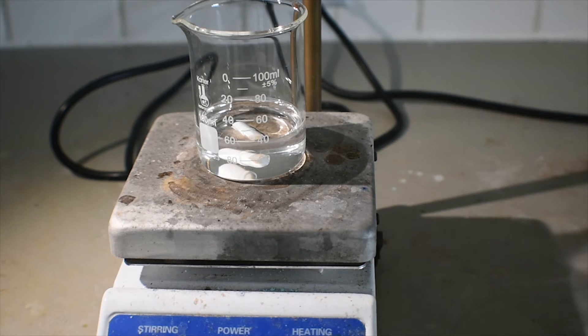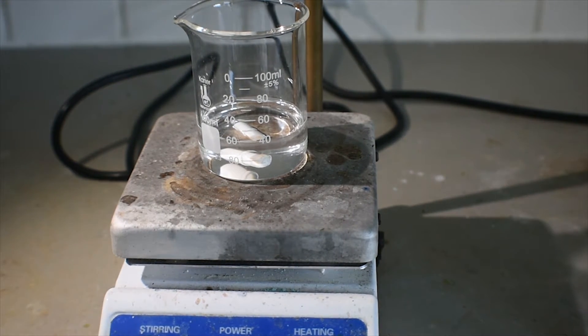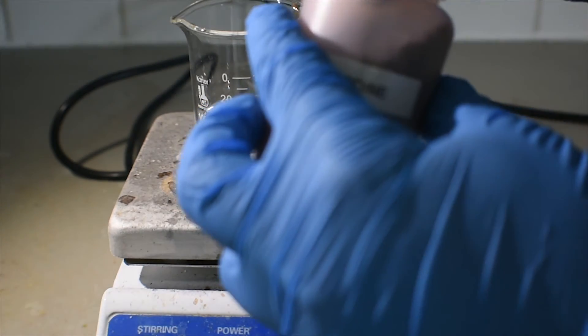Now I'm going to add a few small spatula fulls of solid iodine. This iodine is dried — it's nothing that I made. The iodine that I made is not dry; it's pretty wet, and when it is kept in the freezer, ice forms on it, which is a pretty good indicator that it is not dry iodine. So I'm going to use my dry iodine here that I got online.